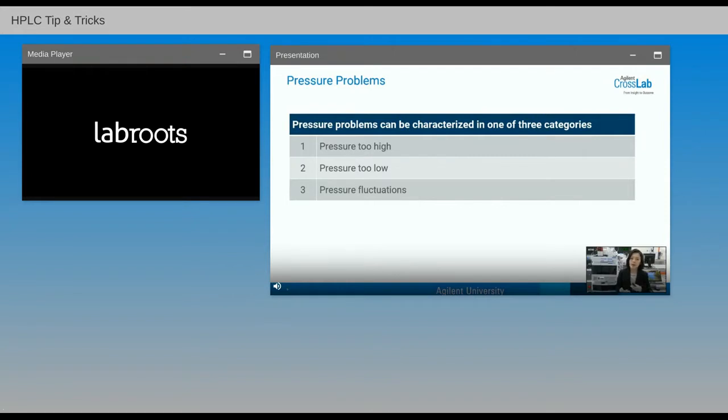That is when there are some particles that are stuck in the system. It could also be salt precipitation. The precipitation slowly builds up, or particles generated in the instrument, debris that may be coming from your valve septa or some degrading seal. So all these slowly build up along the time, and that's how it happens with a gradual increase in pressure.